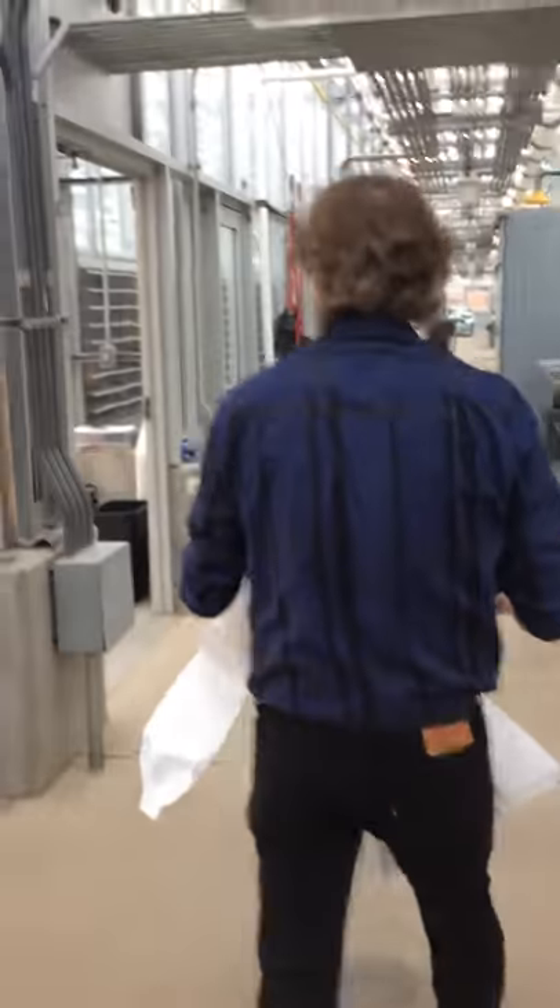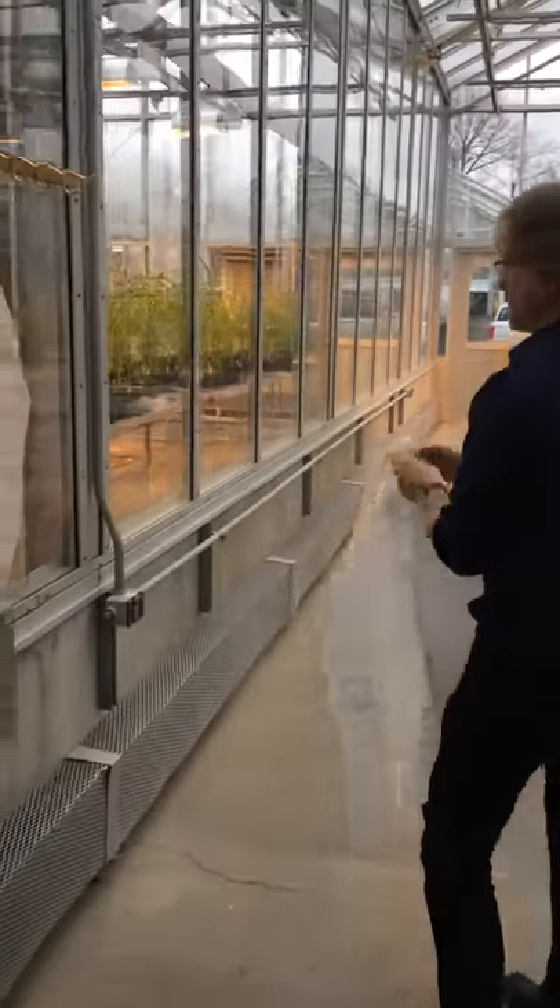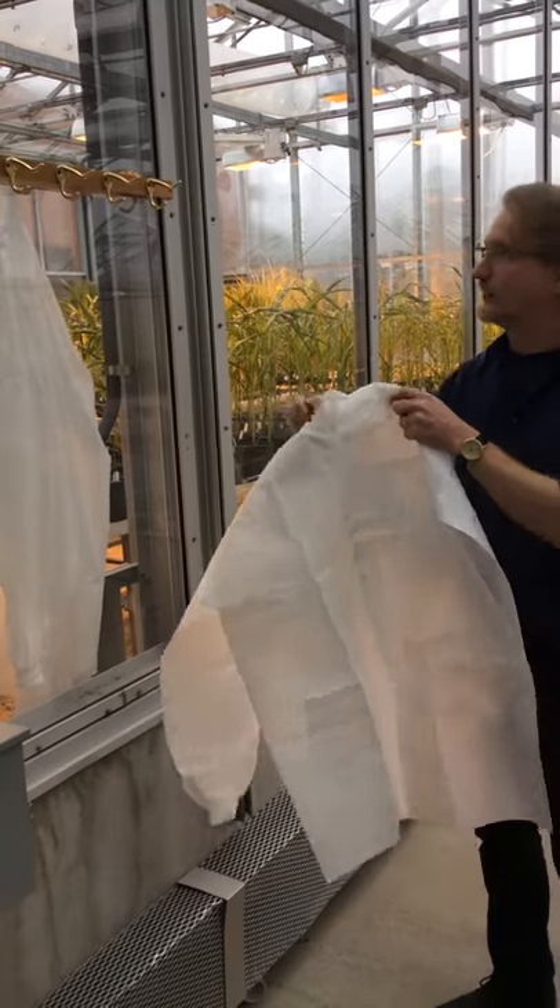You use it inside the greenhouse but don't wear it outside. Whatever it is we're trying to protect the rest of the facility from, we want to contain in this room.